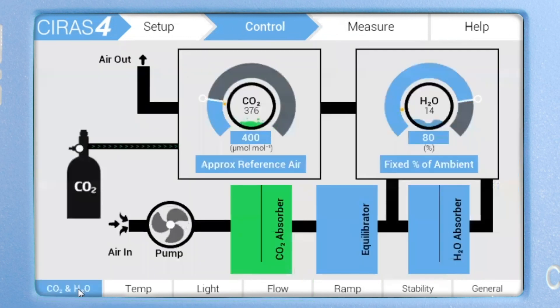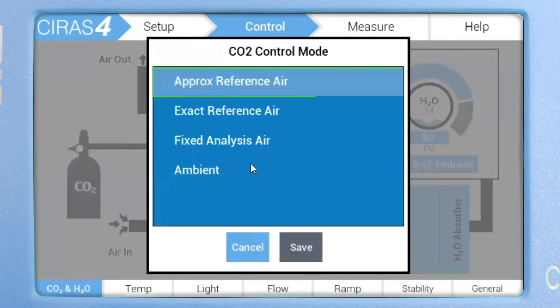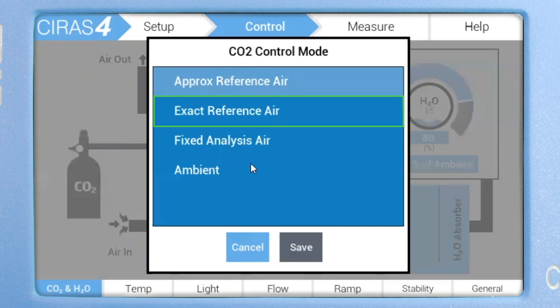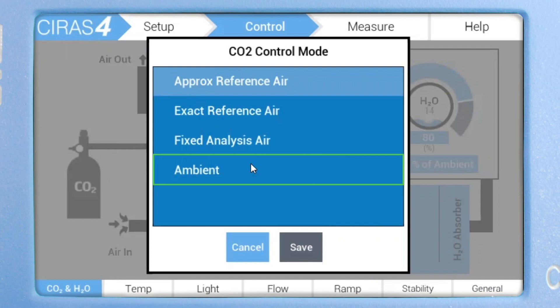Let's start with CO2 and H2O control. Users have the ability to control CO2 and H2O concentrations. There are four CO2 control options available. You can control CO2 to approximate reference air, which is ideal for response curves especially when changing the CO2 concentration at multiple levels. We can control CO2 to exact reference air for users that want to work at a specific CO2 concentration for an extended period of time. Fixed analysis air allows users to control the sample or analysis CO2 concentration, and for users that want to work at ambient levels, this option is available as well.